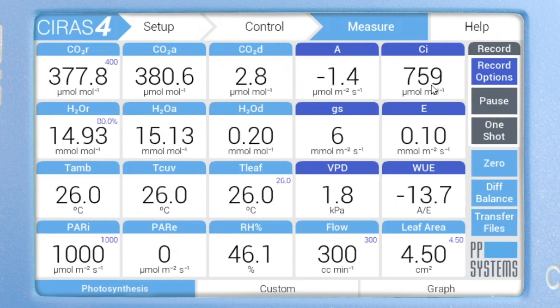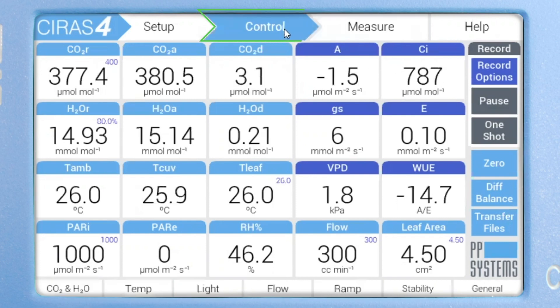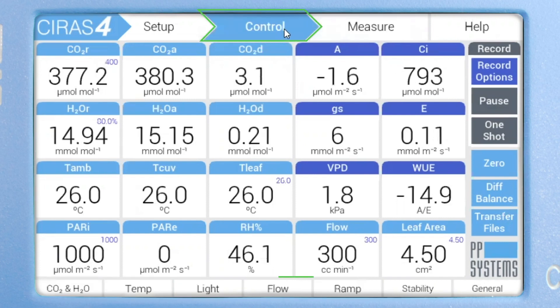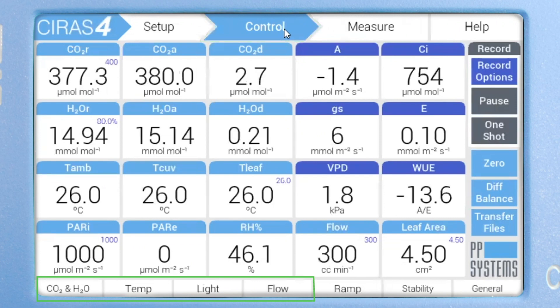One way to manage the environmental controls is through the menu system. From the main menu, tap on the control tab. Note the submenu tabs along the bottom of the screen for CO2 and H2O, temperature, light, and flow rates.